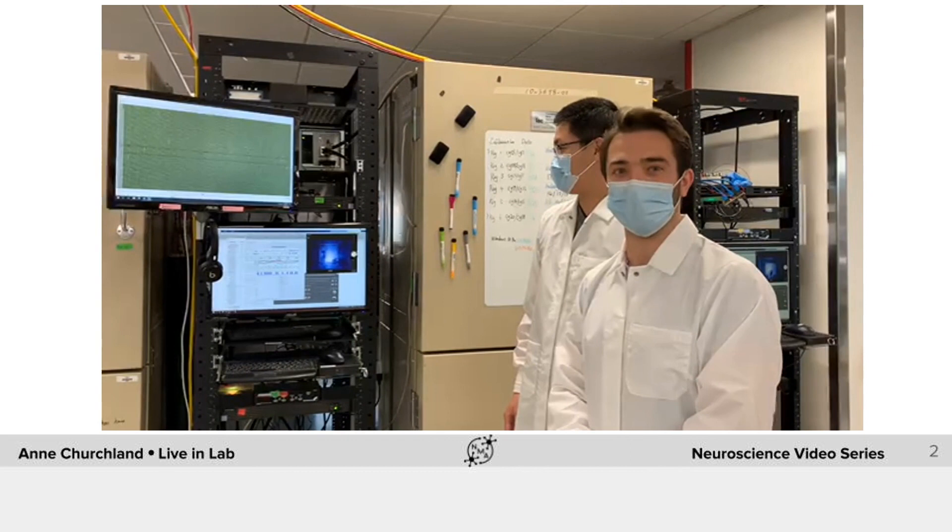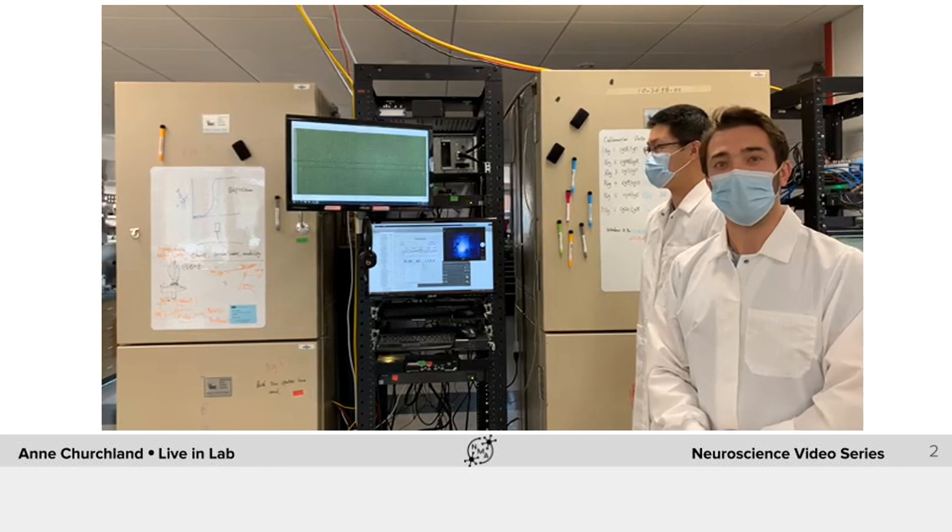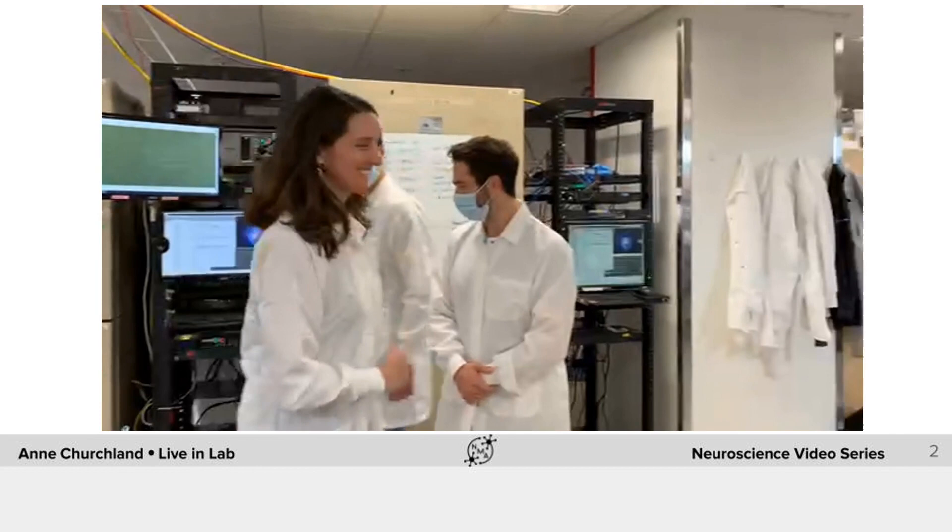And while we're doing the ephys recordings we're also recording from above, we're recording the animal from above so that we can use software like DeepLabCut to track their movements. And remember, ephys is one method of recording neural activity but another method, wide field imaging, we'll be talking about shortly.